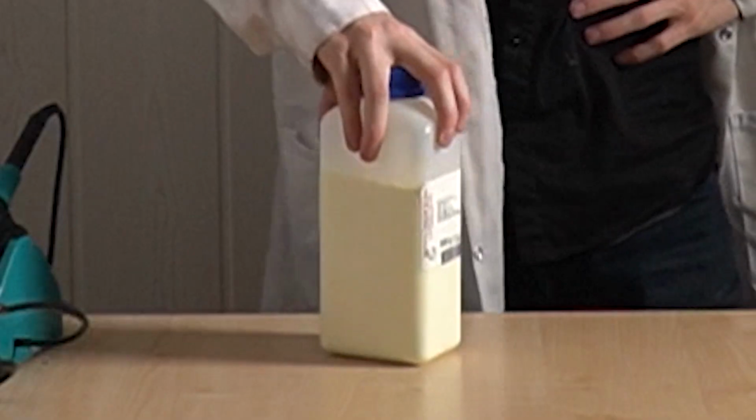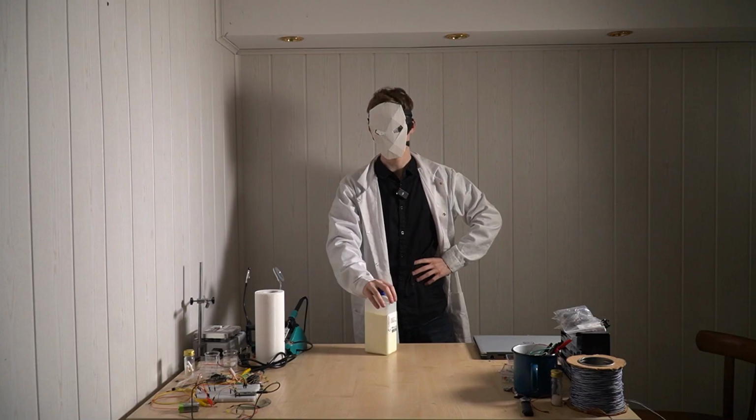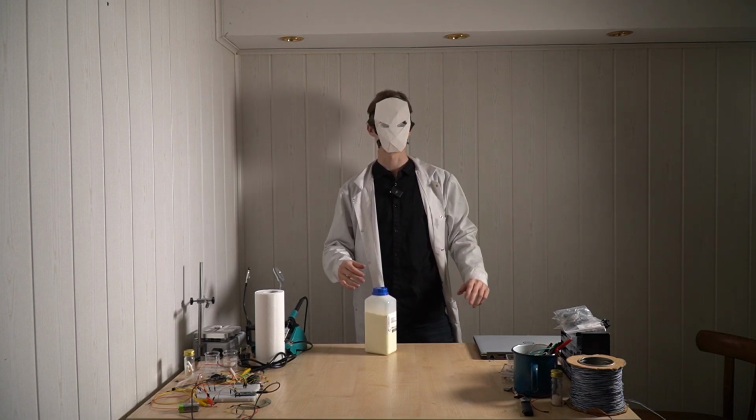Yeah, so we'll make a bucket of sulfuric acid. But how do we make this sulfuric acid? Well, I'm so glad you asked. You see, I've got a lot of sulfur. This isn't even all the sulfur I have. I have a crazy lot. I don't know why I bought it. It was cheap, so I thought, wow, it's a bargain, but it's a serious problem.